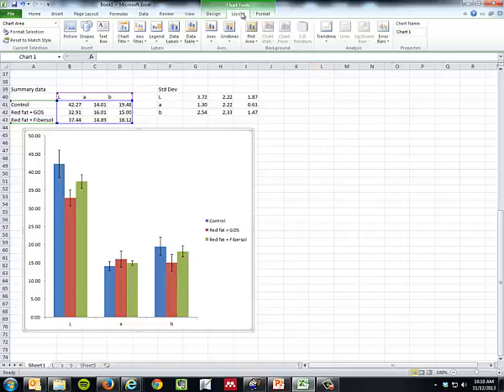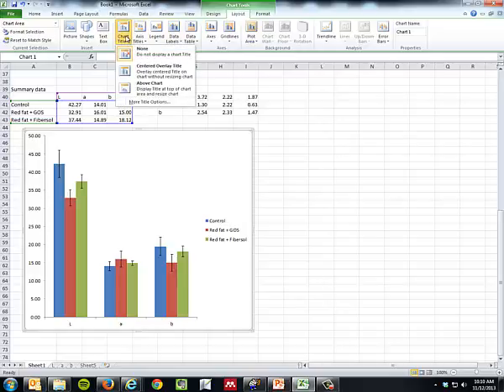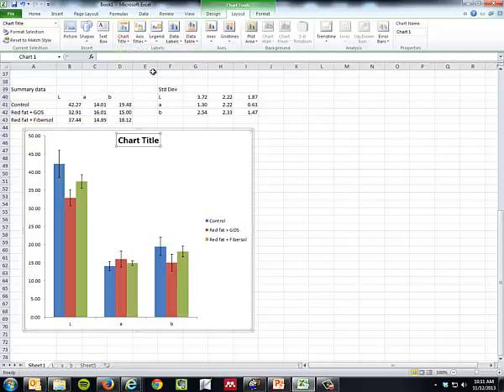So still on the Layout bar, we're going to look at chart title, centered overlay, and we've got it here now, so we'll just go in here and start typing: Hunter parameters for fat reduced muffins. Okay, and I can even save myself a little work if I put Figure 1 in here. All right, so then I'll click the little check mark and that should show up, and it does.